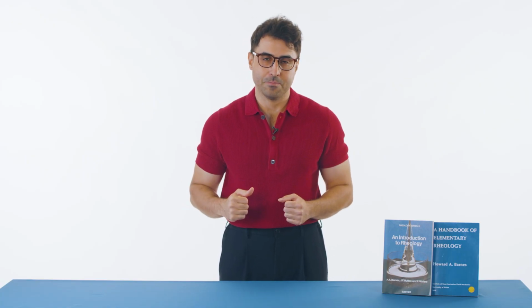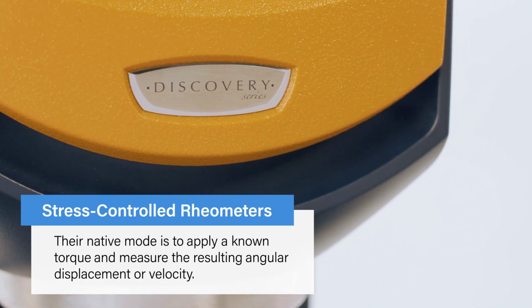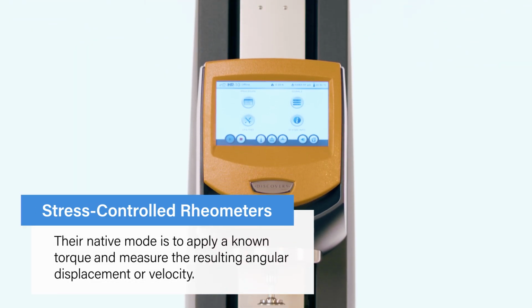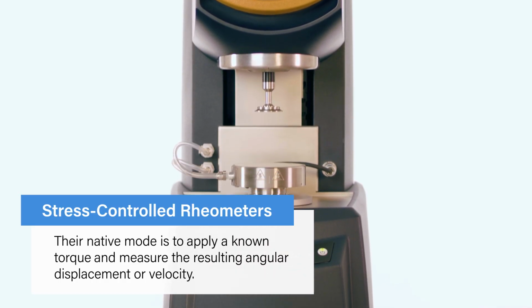At TA Instruments, we offer two main categories of rheometers, each with its own native mode of operation. Stress-controlled rheometers, their native mode is to apply a known torque and measure the resulting angular displacement or velocity.